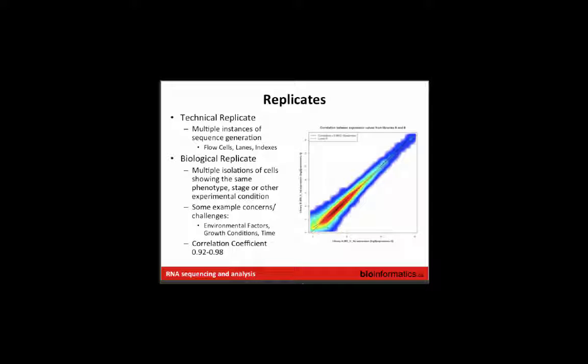So for example, when we process RNA-seq data, we process it lane by lane, and then the results get merged, and then you move to the next step. So it's really easy to say, okay, at the end of each lane by lane alignment, produce a quality report and summarize that at the lane by lane level, or sometimes it's even more than that because you have multiple samples in the same lane with indexes, so then it would be at the lane/index level.